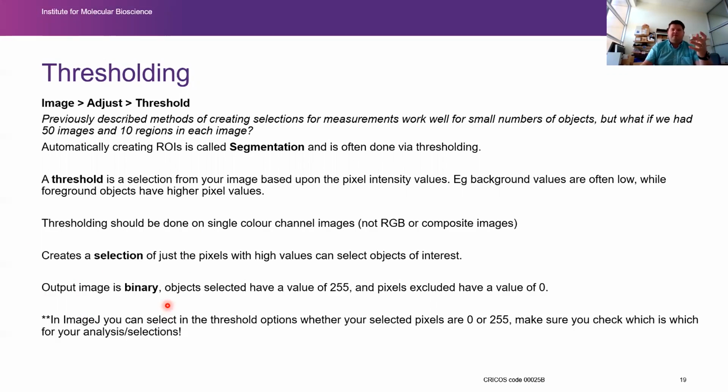Now in Fiji, it gives you the object of the foreground with a value of 255 and the object of the background is 0. And so that's where I was saying before, you might want to subtract 254, and then your object is 1 and your background is 0. And you can do nice multiplications on other images from that. You can change it in the settings, but I would advise against it because down the track you might forget, or you might be dealing with other people's code and it won't expect that. So be careful with changing some of the hard-coded underlying settings in Fiji.